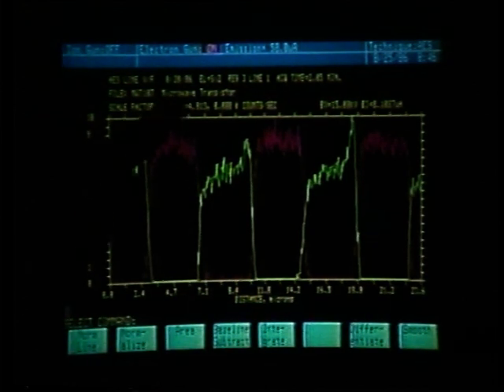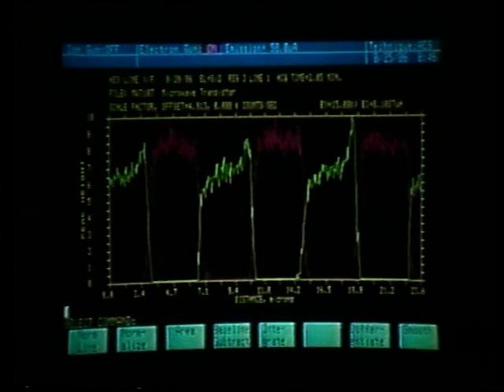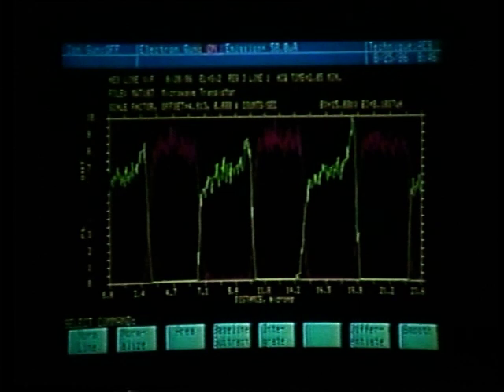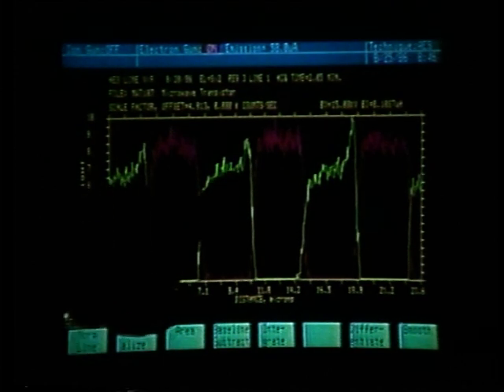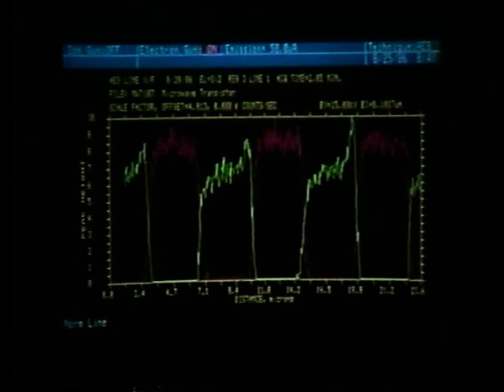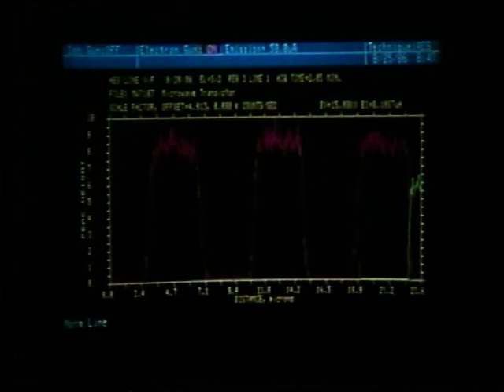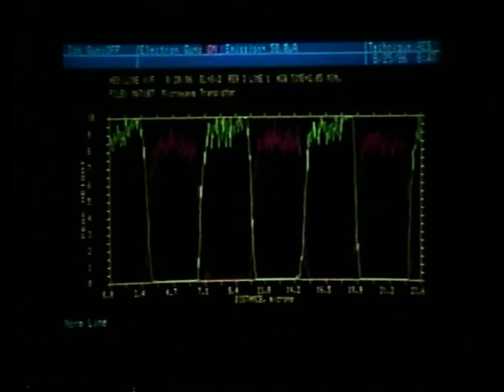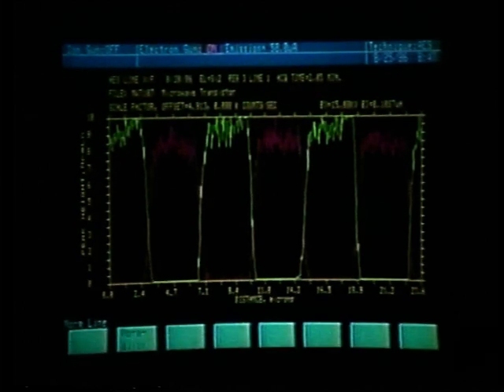In this case, it is our silicon line scan, which is region 3, line number 1, as displayed in our graphics labeling. That will then be the green line scan being silicon. Pressing soft key number 1, we now have a normalized silicon line scan.